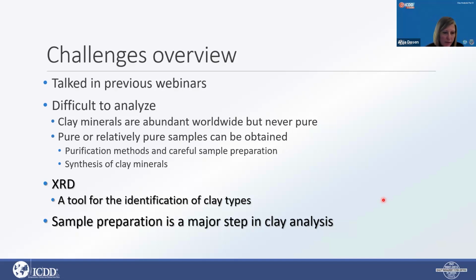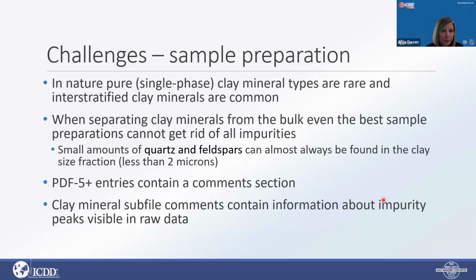So I'm going to talk about some purification methods for samples that contain various minerals. And I'm going to talk about sample preparation. And then one of the ways of obtaining a pure clay sample is synthesis. So synthetic clays are a different story. And then, as we've mentioned before, X-ray diffraction is a major tool still in identification of clay minerals and clay types. And then sample preparation is a major step, if not the most important step, in clay analysis.